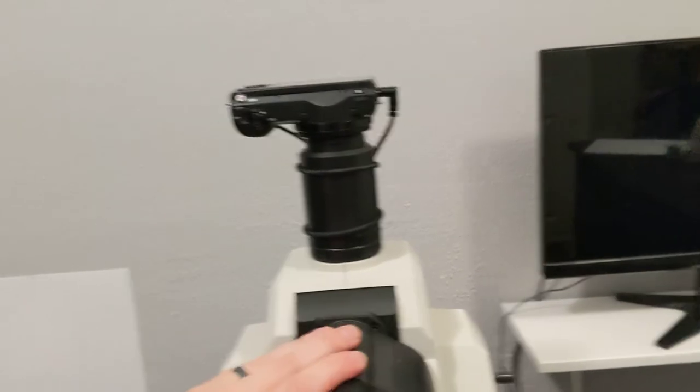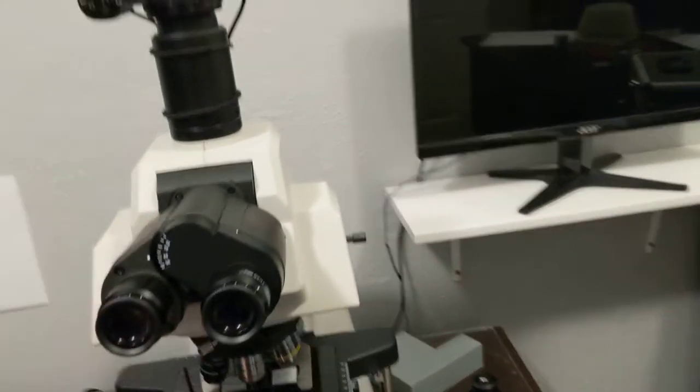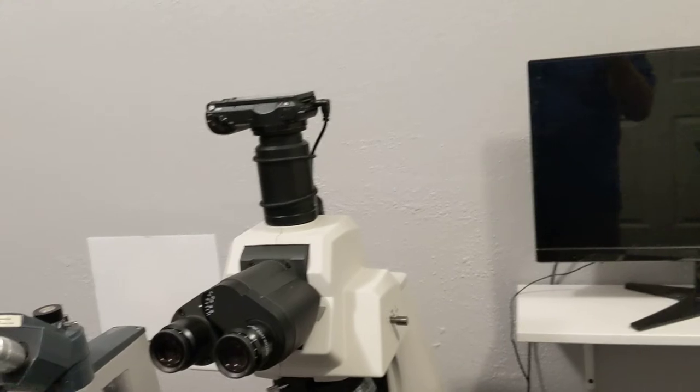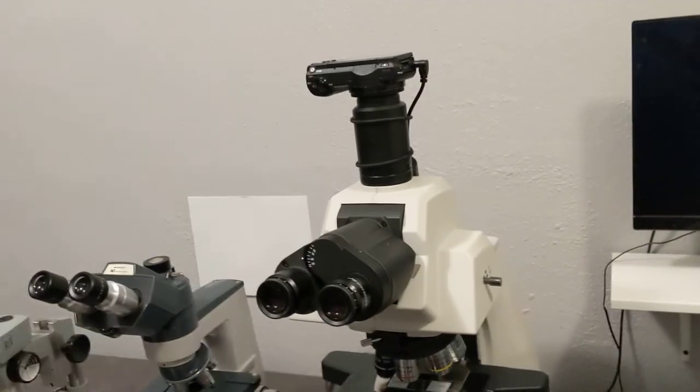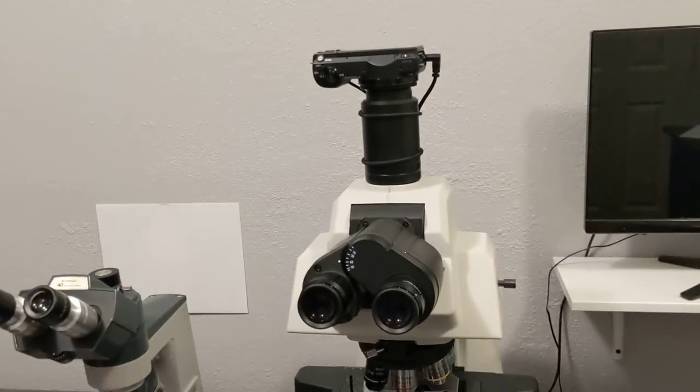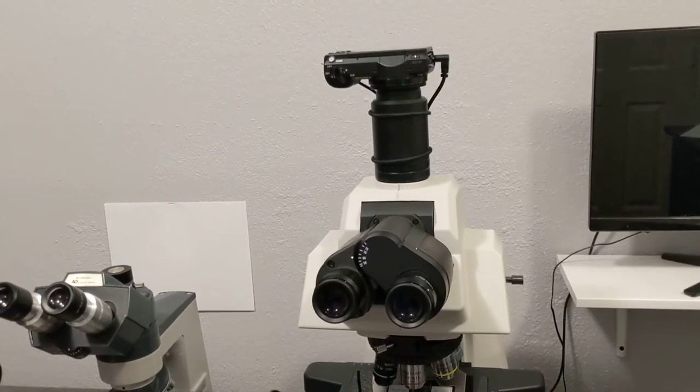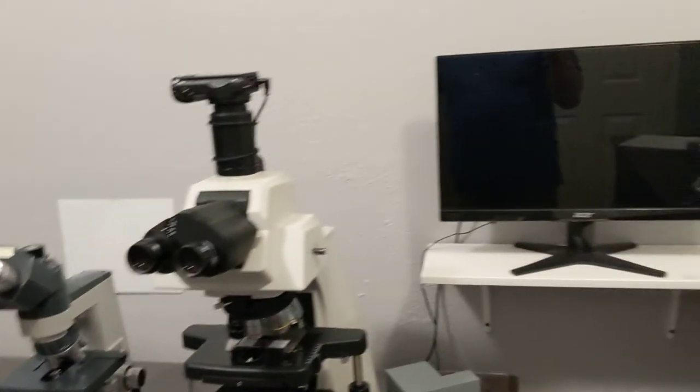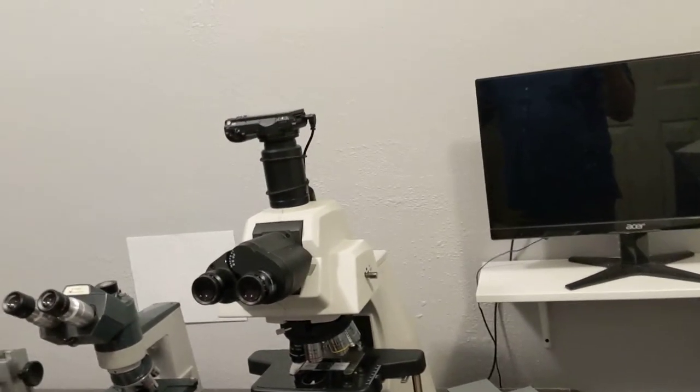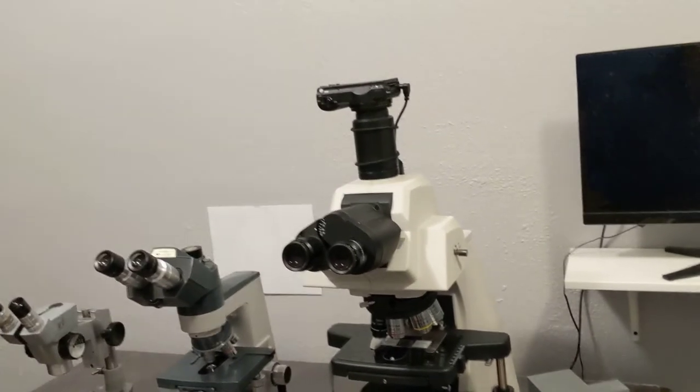The adjustability is really nice. The other thing I like about this head is it's Nikon compatible. You can put it on a Nikon microscope if you need to. Or you could put a Nikon head on this microscope, and it would work just fine.